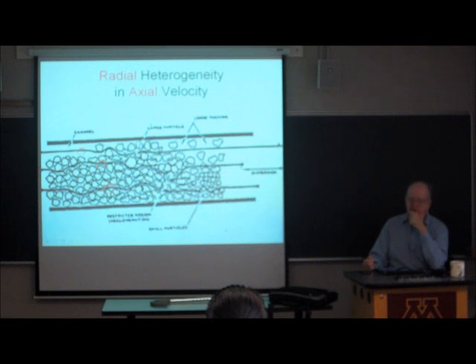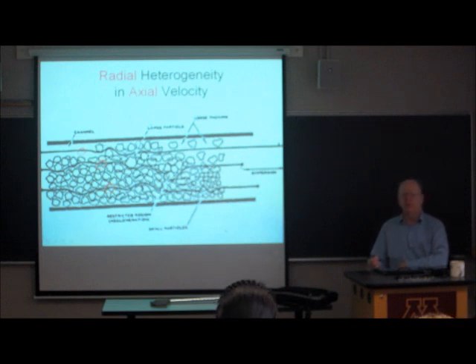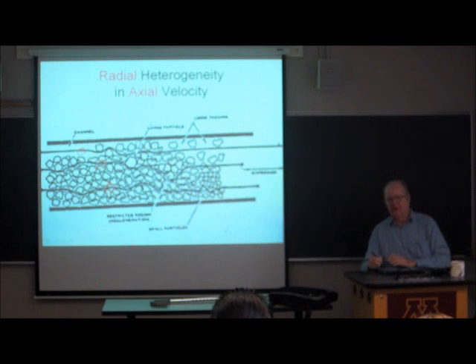Now imagine that you're a molecule and you're in this flow stream, or this one, or this one, but the velocities are not all the same. The molecules are not going to come out the end of the column at the same time.